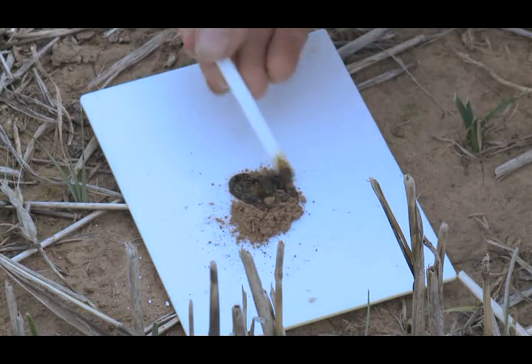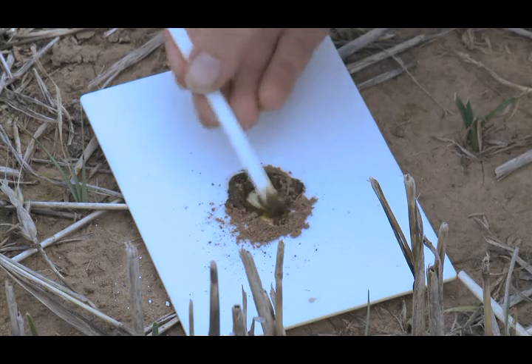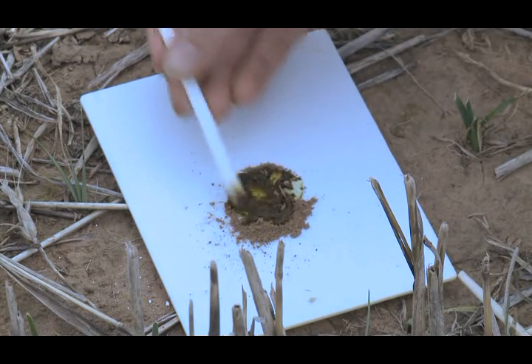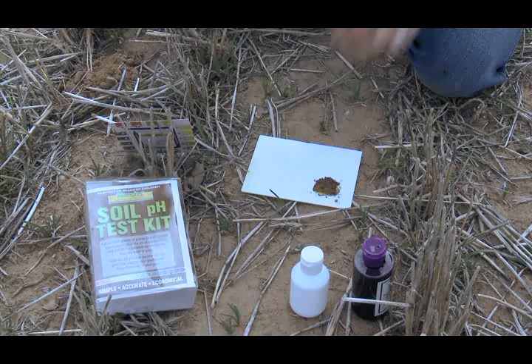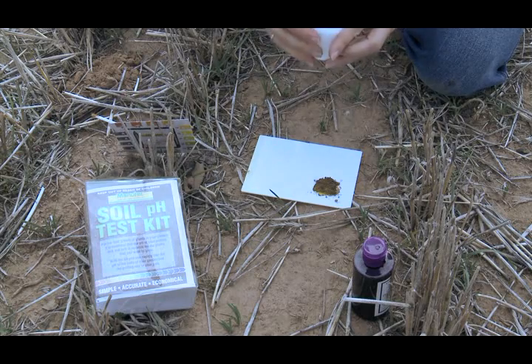Step 4: Stir the soil with the plastic rod until a paste forms. Step 5: Dust the paste with the white powder provided.